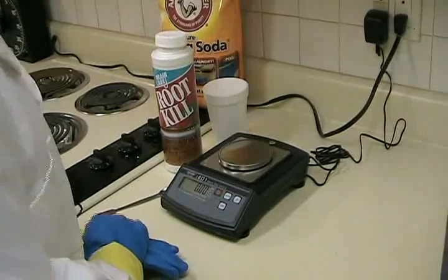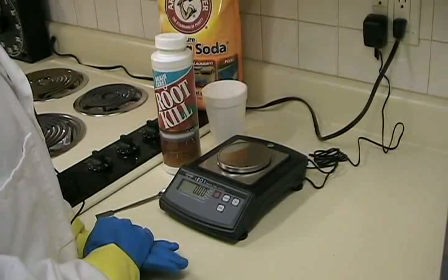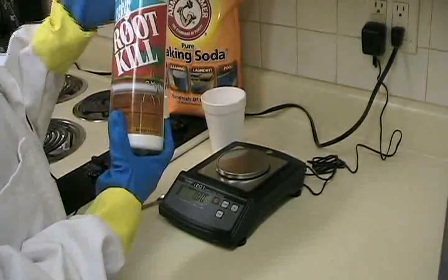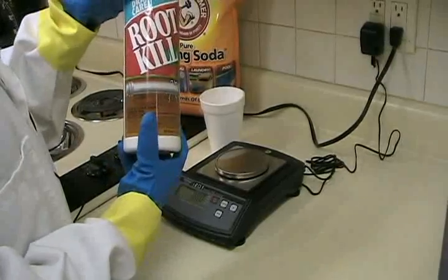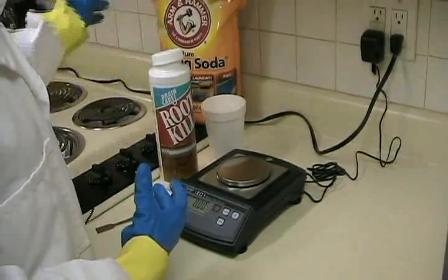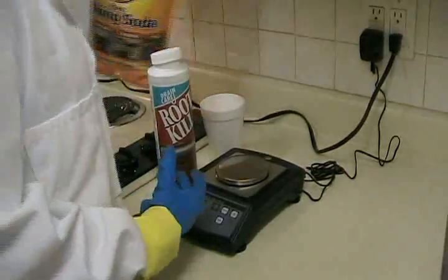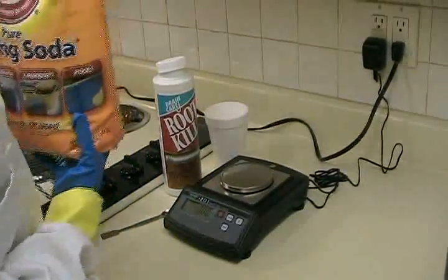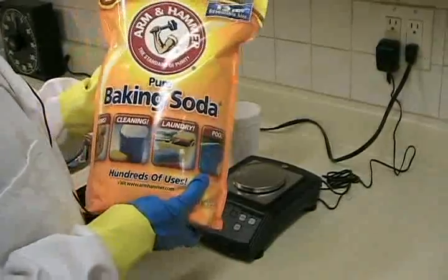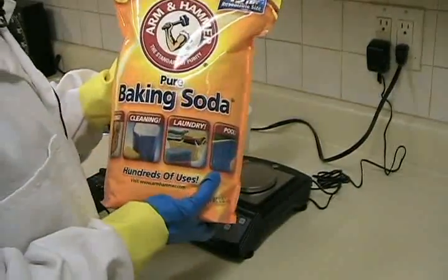We'll begin with two readily available compounds. The copper sulfate is readily available from Home Depot — this is about a two-pound bottle for eight dollars. And the sodium hydrogen carbonate, or sodium bicarb, or baking soda — this is a 12-pound bag from Costco that costs about five dollars.